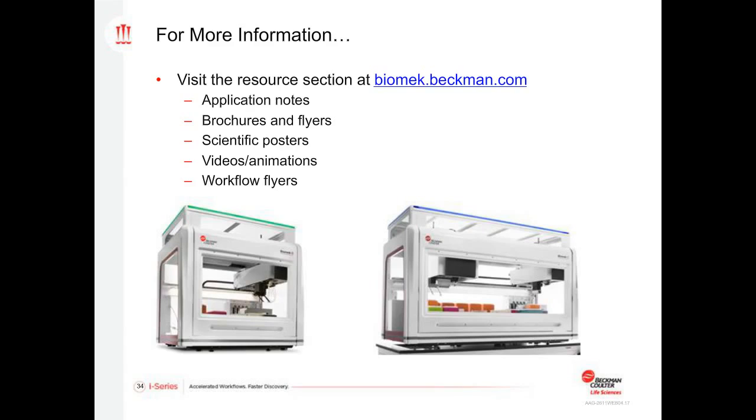That's one of the benefits: in theory, if things are working right, you shouldn't really be spreading contamination. If you want to treat it the way I would treat a contaminated incubator, you can spray things down with ethanol, but just throwing away the plate was sufficient for me. I didn't have any continuing problems after that. There was not really any need to do anything extreme. We do have information on chemical compatibility if people need more information about sterilization. But honestly, for me, everything stays pretty well contained within the plate, so throwing it out took care of my problem.